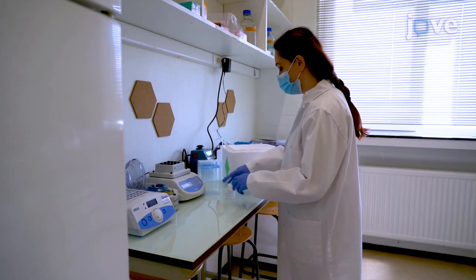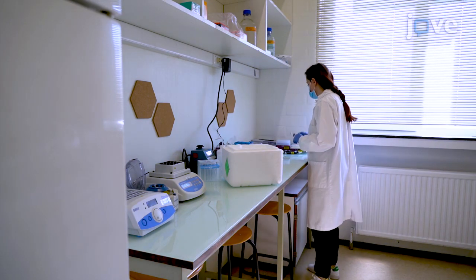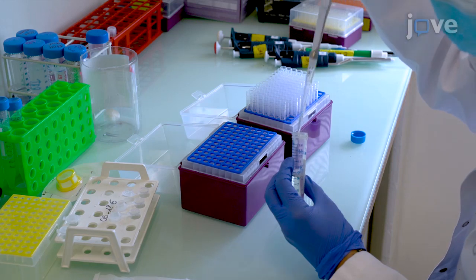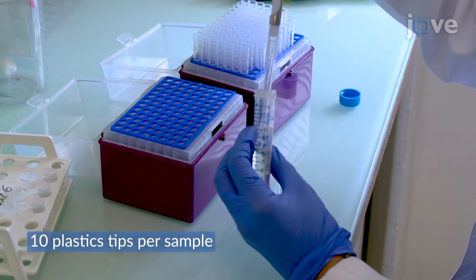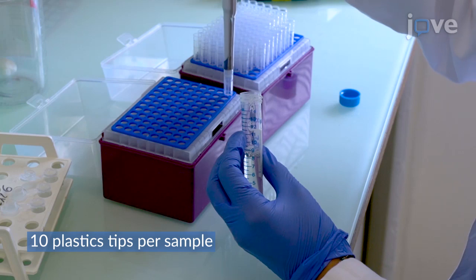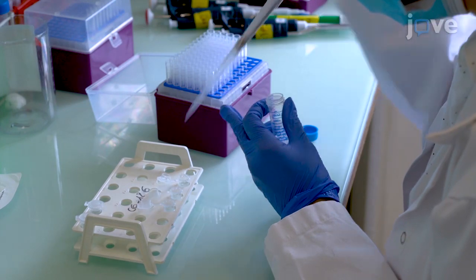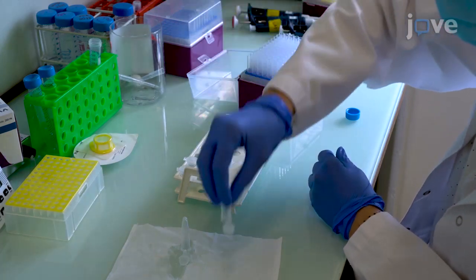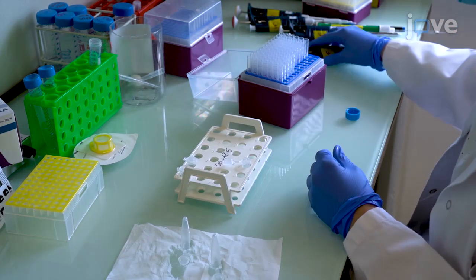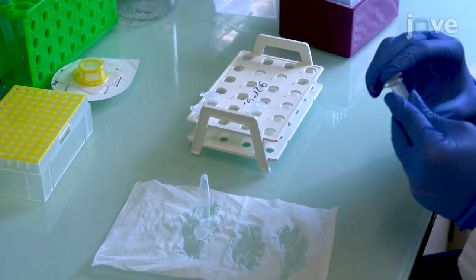To begin, pre-chill buffer A and B from a detergent-free nuclei isolation kit by placing them on ice for at least 30 minutes. Coat tubes and pipette tips with 5% BSA solution to enhance recovery of the nuclei. To coat the pipette tips, pipette 5% BSA solution two to three times and air-dry for two hours. To coat the tubes, fill them with BSA, invert three times, remove the solution, and air-dry upside down on clean tissue paper for two hours. Coat one collection tube and one 1.5 milliliter tube per sample.